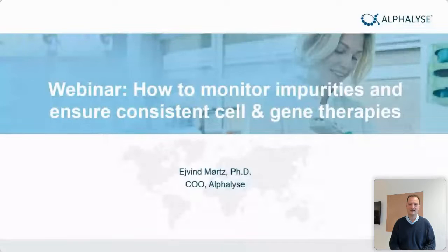So I'm really happy to see that so many have signed up for this webinar. What we will talk about today is how to ensure consistent manufacturing and analytics for cell and gene therapies. We will cover three topics. The first one is how the FDA is requesting more consistency in the manufacturing and analytical methods applied for cell and gene therapies. And number two, what is the complexity of these samples that makes it so difficult to use classical impurity analysis methods.